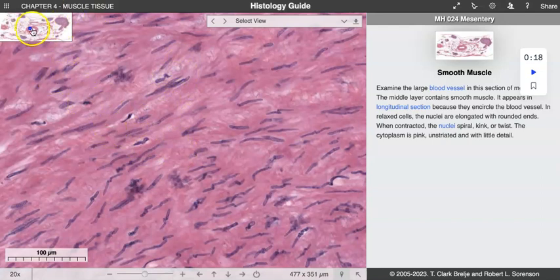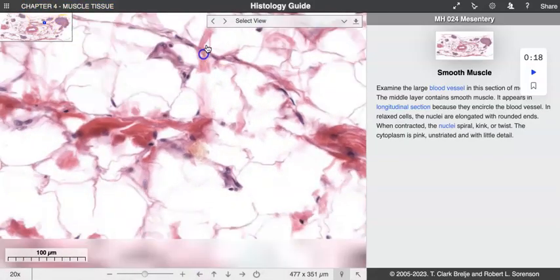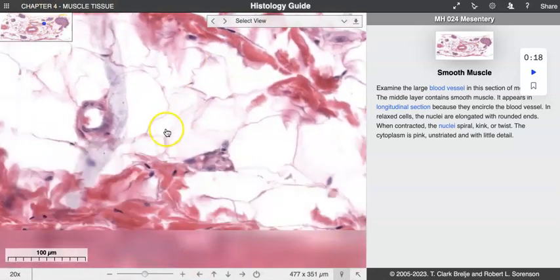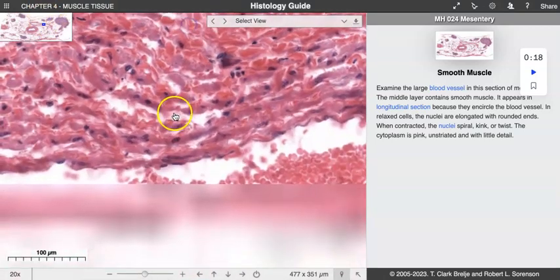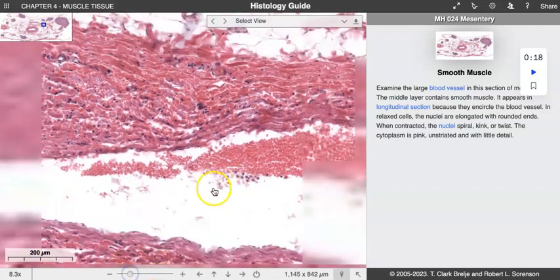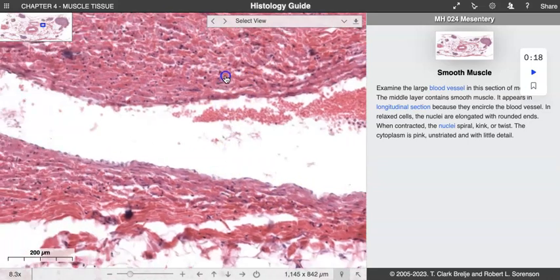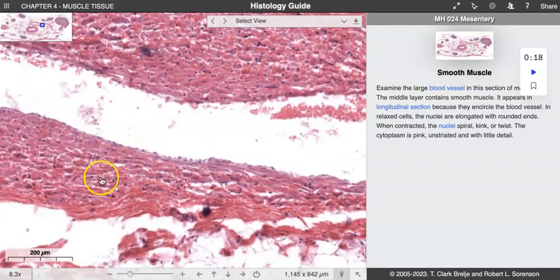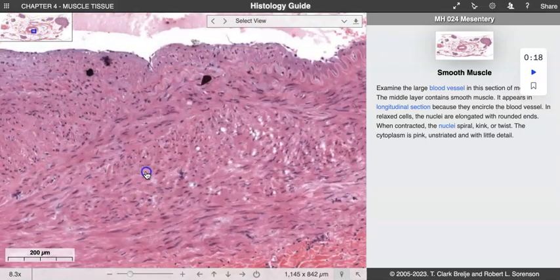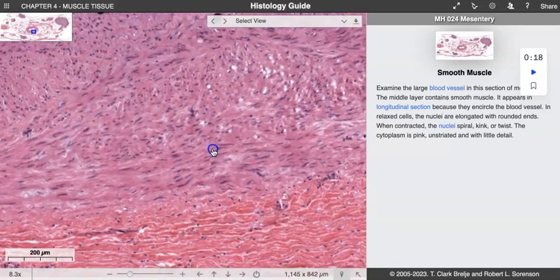Okay, so whether we pick a big artery like this one or this one over here, you could pick a vein, I suppose, but it's going to definitely be a little bit harder to make out your smooth muscle because there's not as much muscle here in our vein. So I think if you are really skilled in finding some of this tissue, you'll be able to see it. This one just has so much more protein fiber weaving into the smooth muscle. So I would really stick with the artery over here and work your way in from the endothelial lining outward.